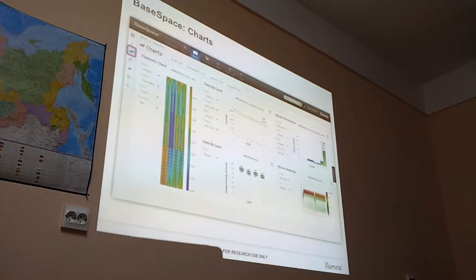And if in a mixture you make a mistake with one library quantification, then this will impact automatically all other libraries in the mixture. So you have to be really careful to quantify them correctly.